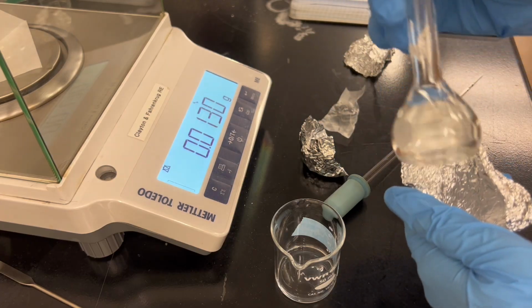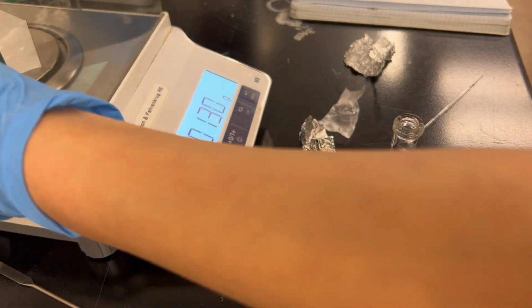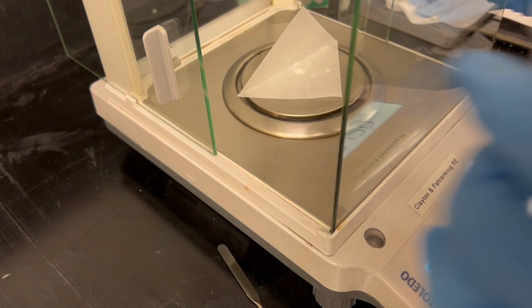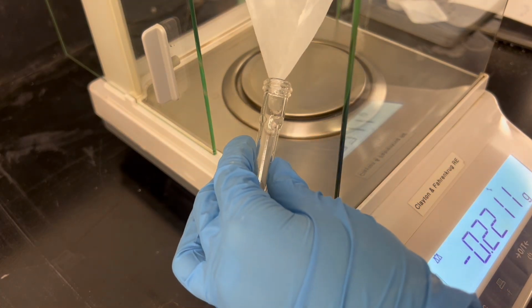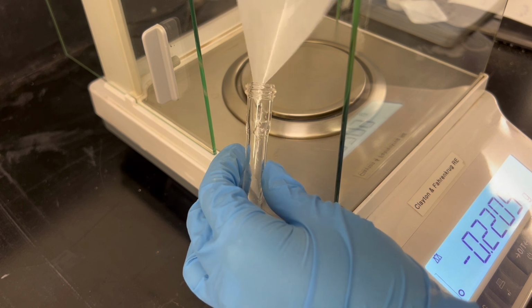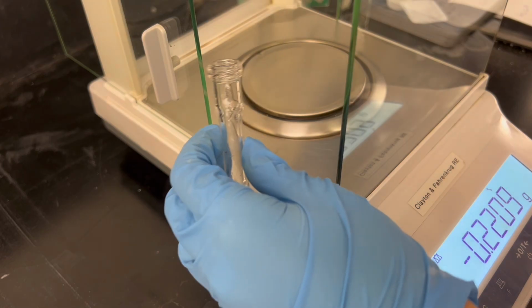When there are only a few minutes left for the degas solution to finish, we could start measuring the PFAS, and when the solution is ready, we take it to mix with the PFAS we measured. This step is pretty similar to the step where we mixed the OPD with solvent. We pour it into the flask and rinse it with some solvent. This time we'll make sure we fill it up to the line.